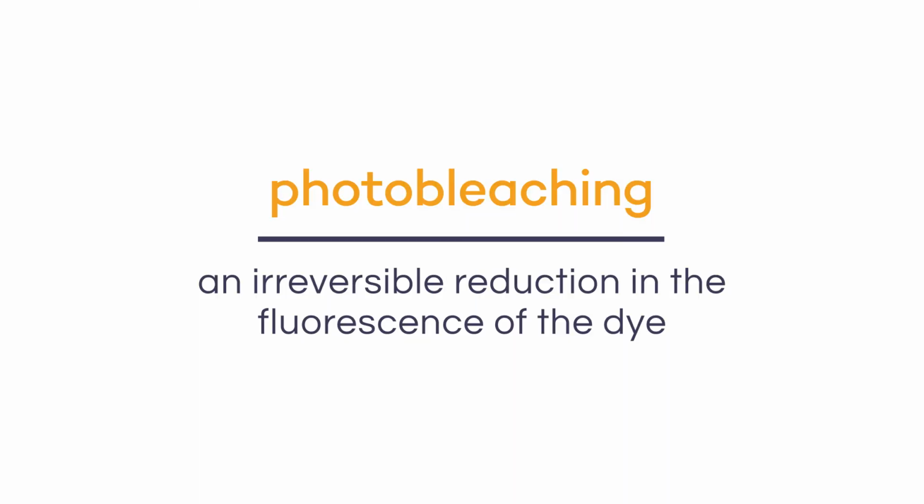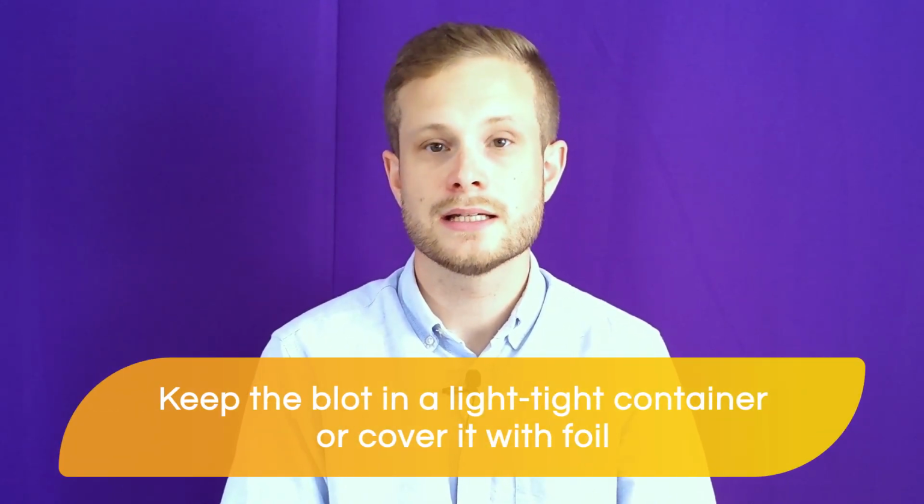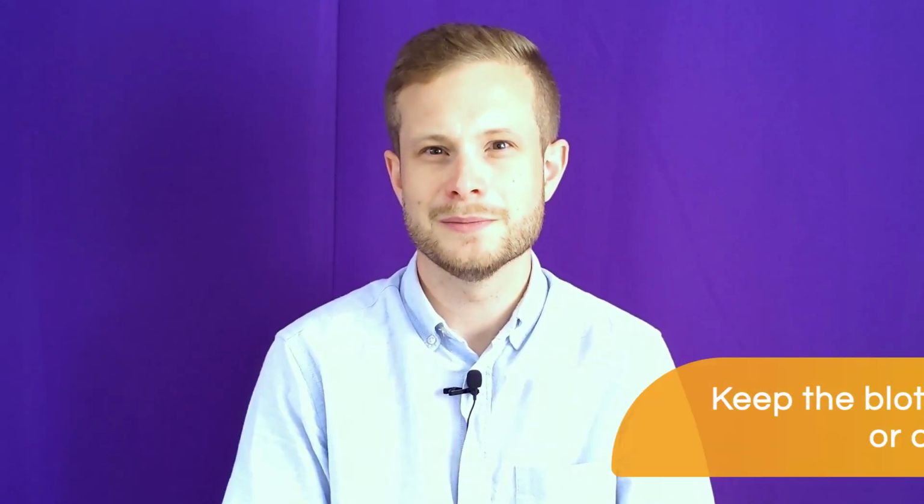However, remember that we now have dye-conjugated secondary antibodies bound to the membrane, and the dyes themselves are sensitive to strong light sources, which can cause photobleaching, which is an irreversible reduction in the fluorescence of the dye. Because of this, it is important to keep the blot protected from light while it is being dried or stored. So make sure to keep it in a light-tight container or covered over with foil as a minimum. Later, Jessica will guide you through the best practices for imaging your blots, whether they are wet or dry. But first, in the next couple of lessons, we'll discuss the science of stripping, reprobing, and re-imaging your membranes.